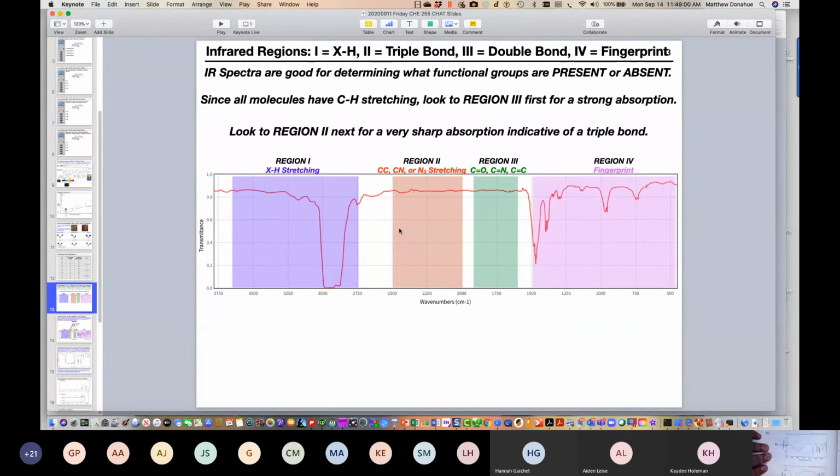What you observe instrumentally, the output, might not fit your assumptions of how it should look. But when you're looking at this from left to right, do you think it's an acid, an alcohol, or neither? The class says carboxylic acid. So acid is the correct answer. And how do we get that?